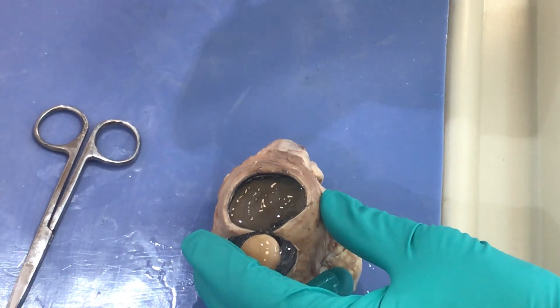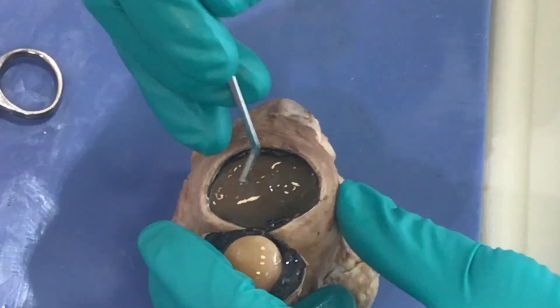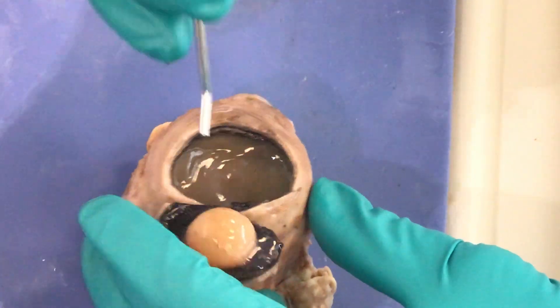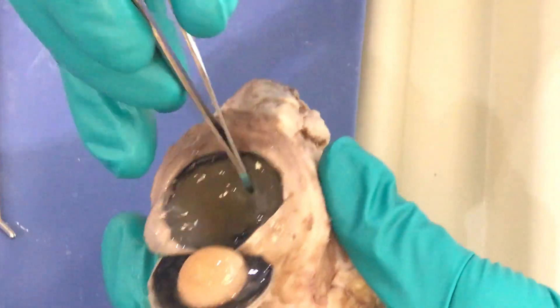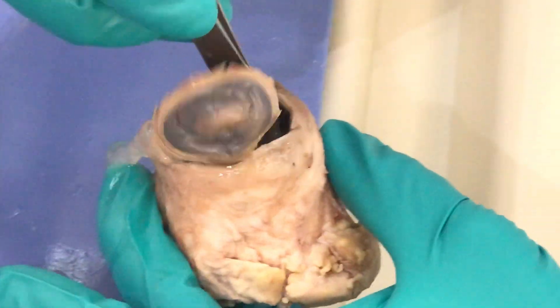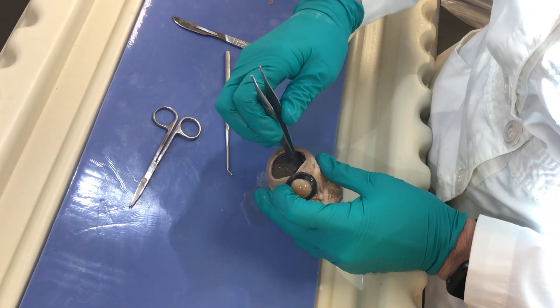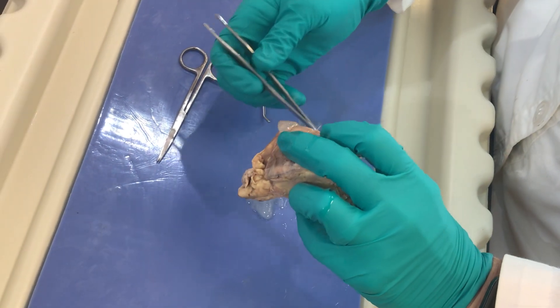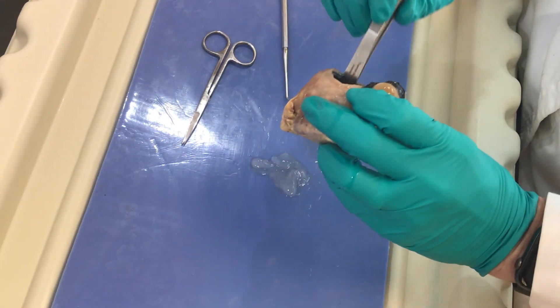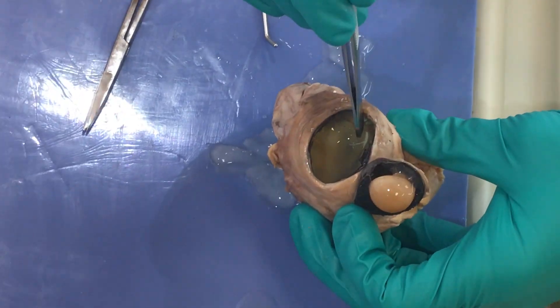The job of the vitreous is a couple of things: it is clear and does refract light, but mostly it has substance so that it can keep the retina attached to the back of the eye. I'm going to attempt to remove this vitreous gently — you can scoop it out very gently. The function of the vitreous is to hold the retina in place, so there's a good chance the retina could come with it. Here you can see I've removed the vitreous, and this tan structure back here is actually my retina.